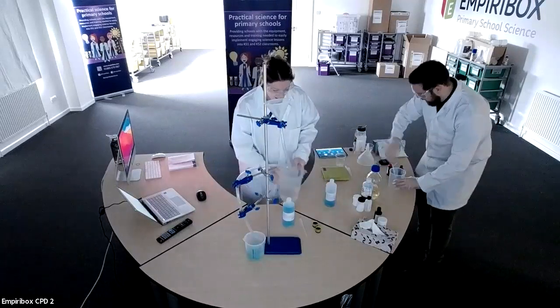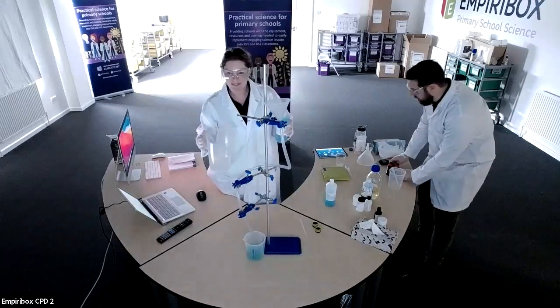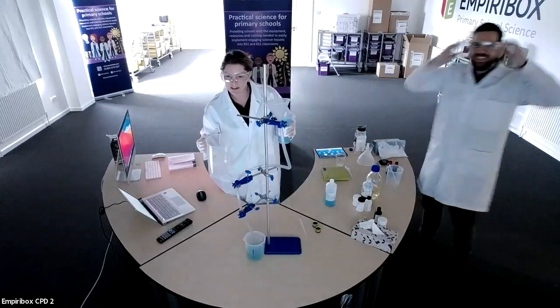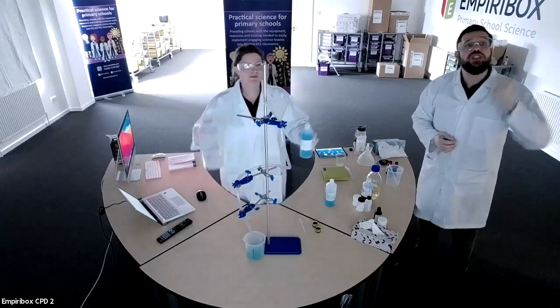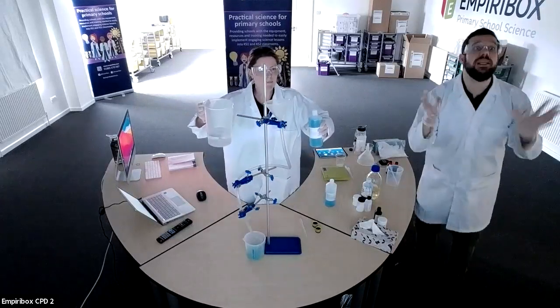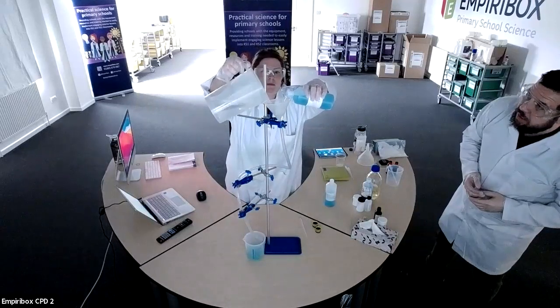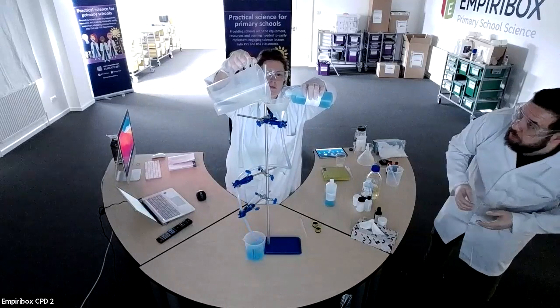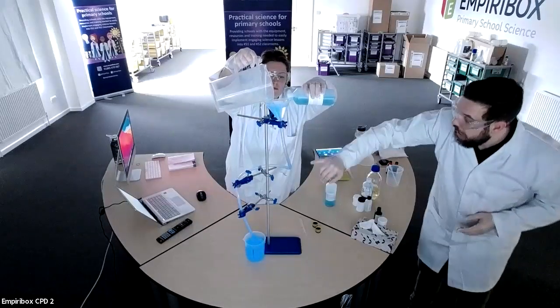All right, come on, fingers crossed this time. Now, boys and girls, what you should see. Oh, somebody's had great fun making the pop rockets. So, boys and girls, what you should see is actually a change, light is produced. So, if I put these two together, there we go. That's a bit better. Pour a little bit more. I don't know if you guys can see how blue it goes.